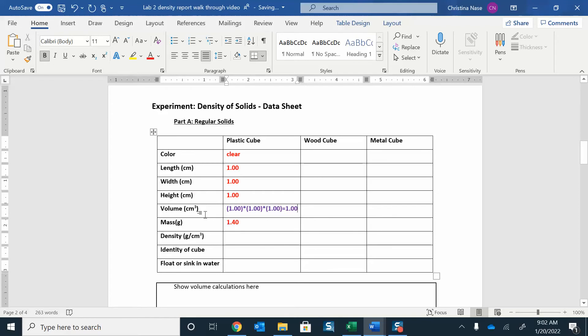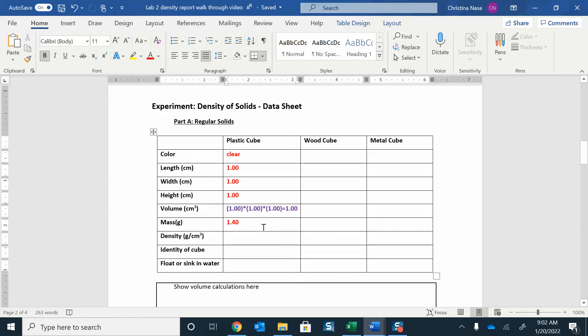One centimeter cubed is the same as one milliliter, just for reference. You're also going to weigh the cube. Each cube will have a different mass. This one was 1.4 grams.